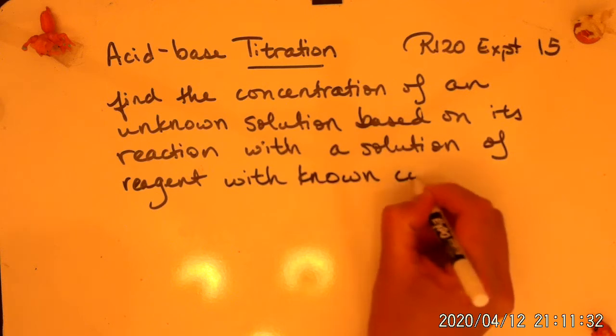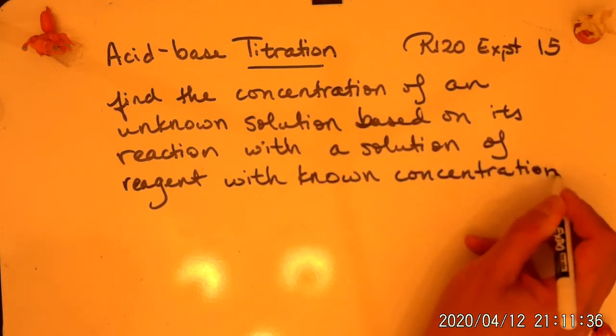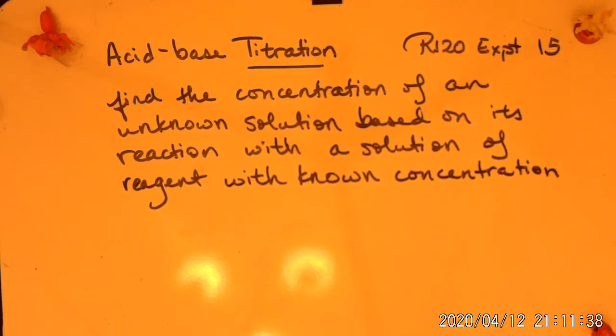Okay? We will be talking about acid-base neutralization. We're not restricted to that when we talk about titrations, but that's what you'll see most commonly.